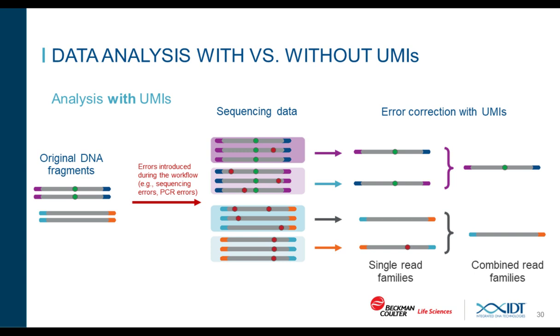We have time for one more question. There is gDNA contamination in an eluate of the extraction minimax. How do you prevent that from happening?